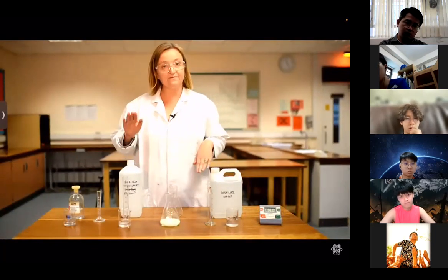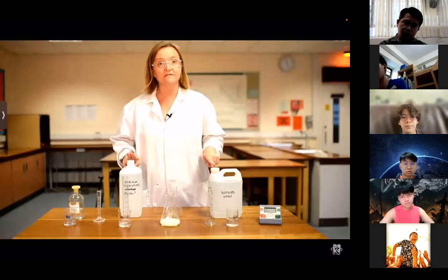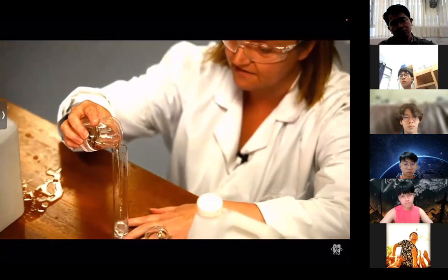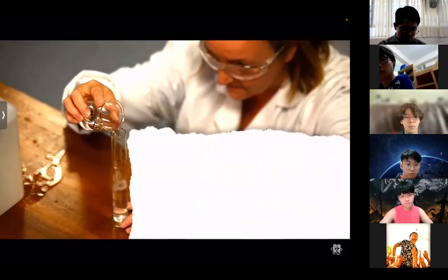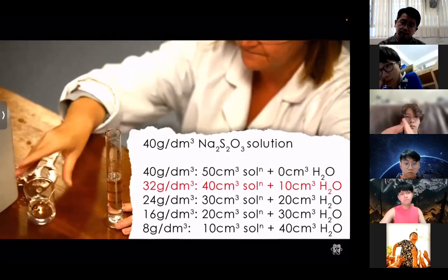Now I can vary the concentration by mixing different proportions of the sodium thiosulfate with distilled water, but still keeping the total volume as 50 centimetres cubed. I'm going to measure out 40 centimetres cubed this time, carefully and slowing down as I get near the 40 mark, a little bit more, and I'm there.